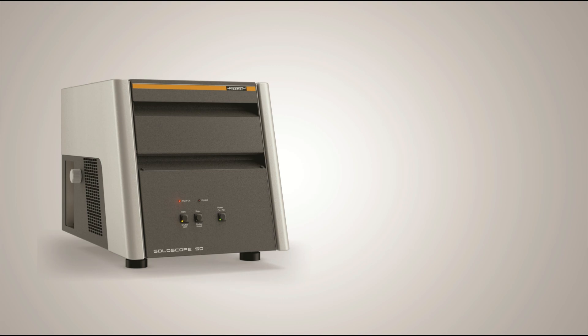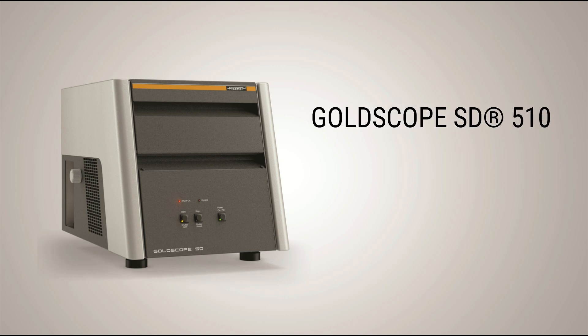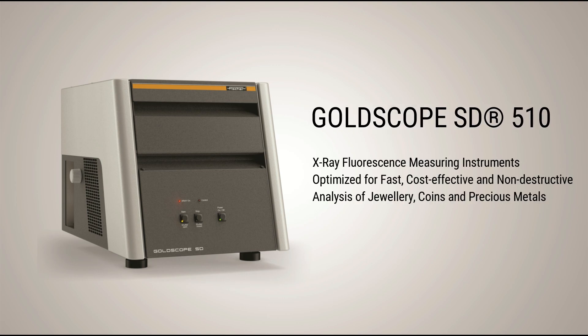X-ray fluorescence measuring instruments are optimized for fast, cost-effective and non-destructive analysis of jewelry, coins and precious metals.